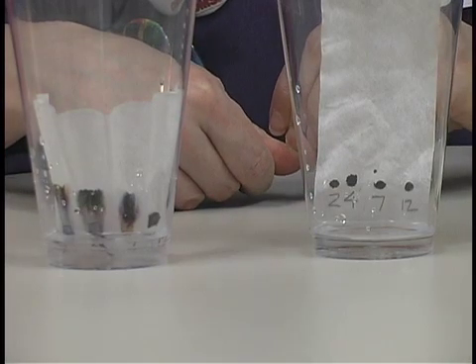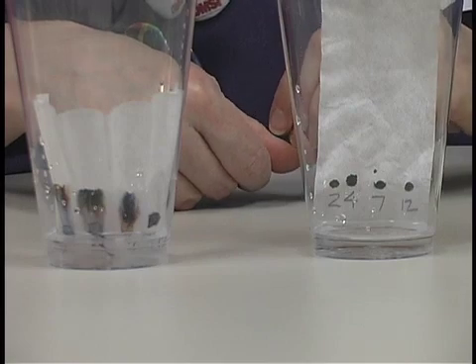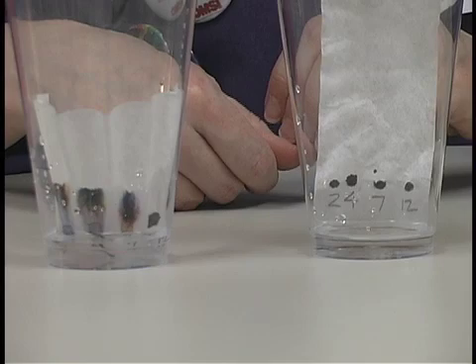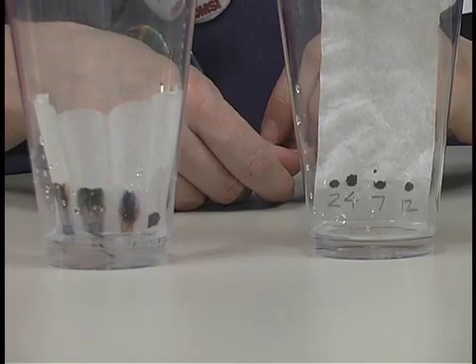Now comes the part where you just have to be a little bit patient. You're going to wait about 5 to 15 minutes, depending on how clean you want your separation. The longer you let it run, the better your colors will be.